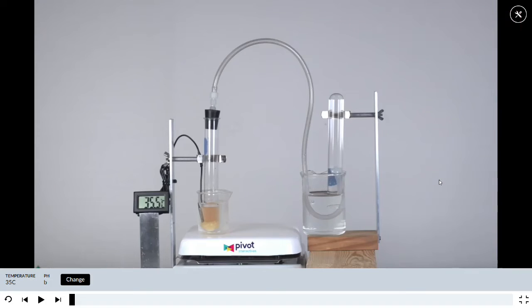One of the virtual labs we're working on in AP Biology is the enzyme lab, and specifically it looks at the activity of the enzyme catalase in breaking down hydrogen peroxide into oxygen and water. And the setup we're going to use in this virtual pivot lab is the idea that if we collect the oxygen that's produced, we can measure the amount of enzyme activity that has taken place.